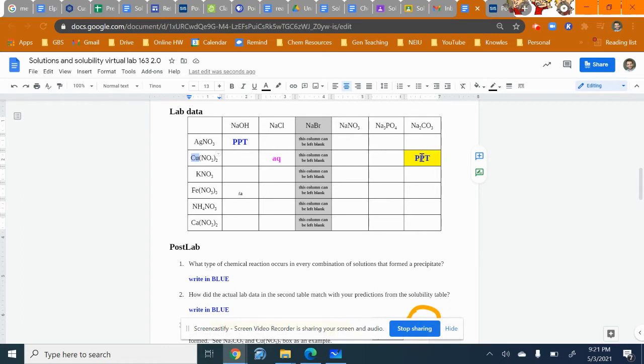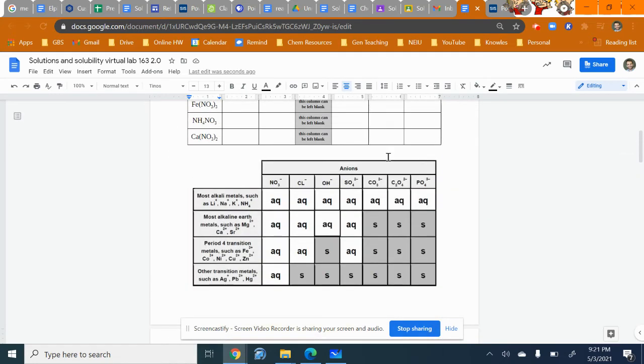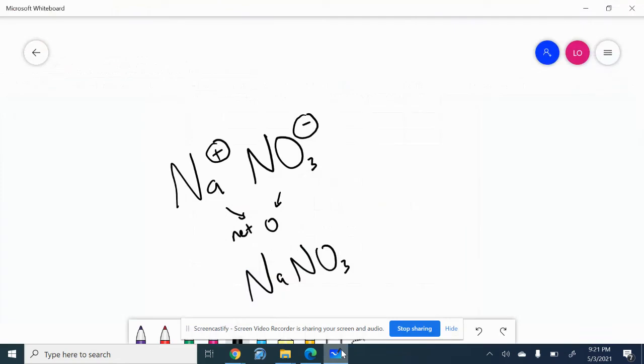And because we saw a precipitate in the table, I hope that it will show me that a solid or precipitate forms from that new combination. So in this table, I can see copper, Cu, which is a 2 plus ion, copper 2 plus, and CO3, which is a negative 2, and that has a solid form there, which is what I would expect from a precipitate, where I observe that in the reaction.